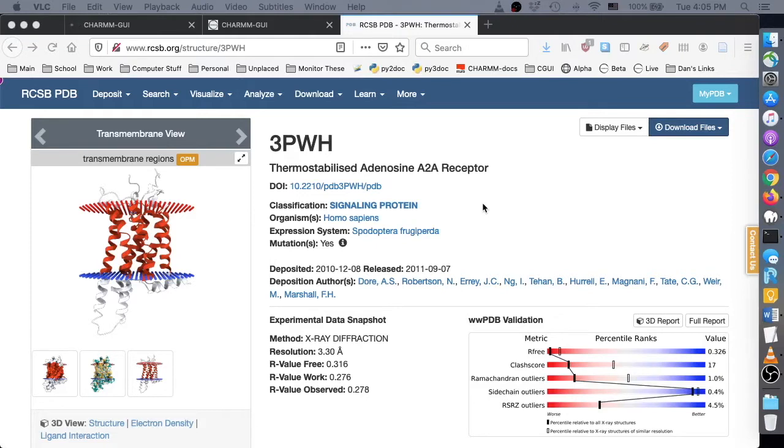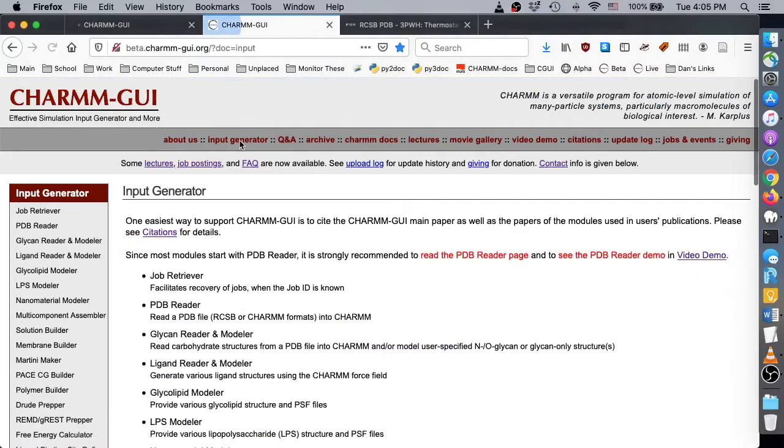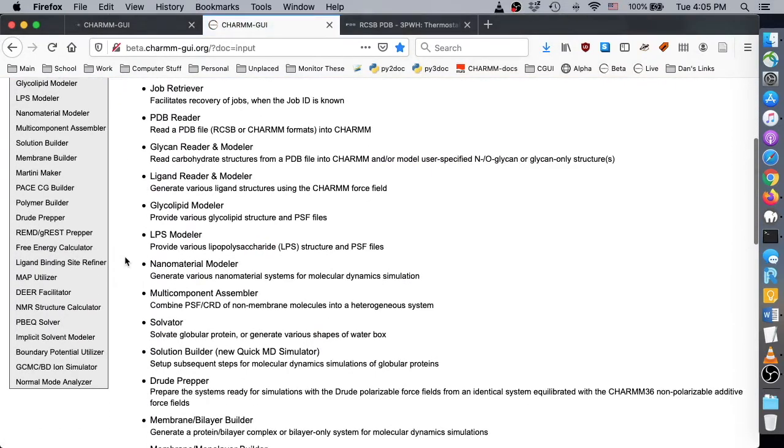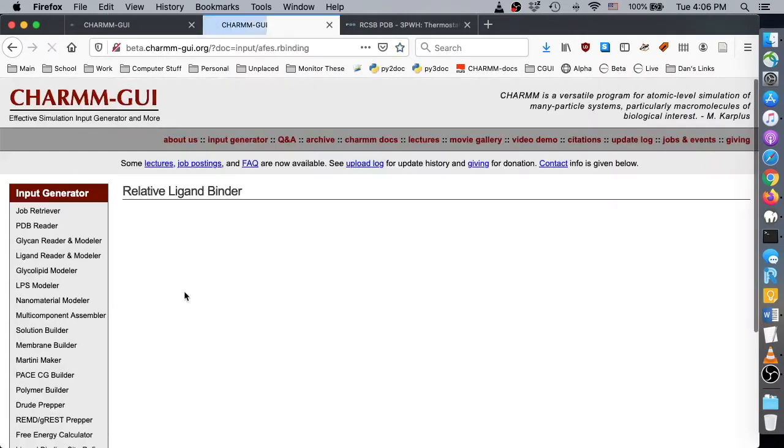In this demo, we will use the same adenosine A2A g-protein coupled receptor with PDBID 3PWH and three ligands, so all the steps up to the ligand uploading step are the same as in the previous video, except that we start with relative ligand binder in the free energy calculator submenu.